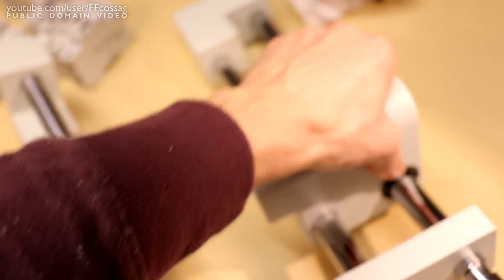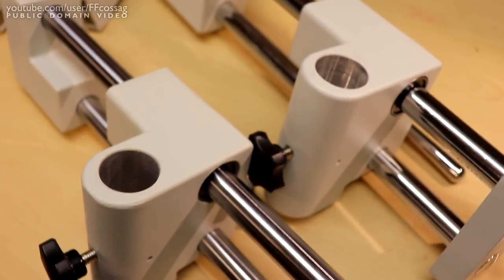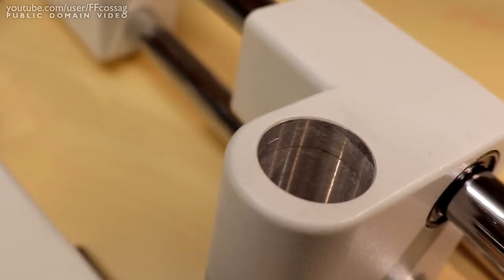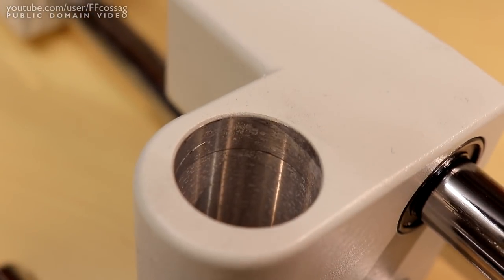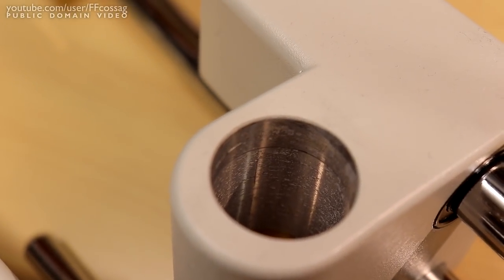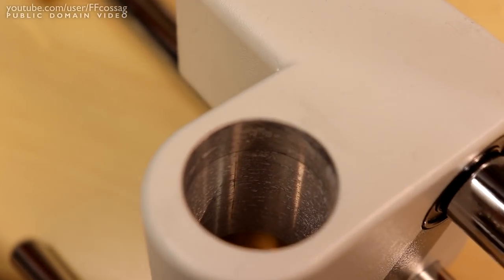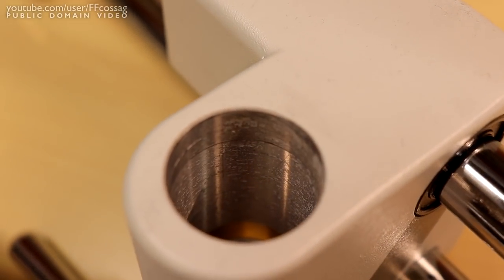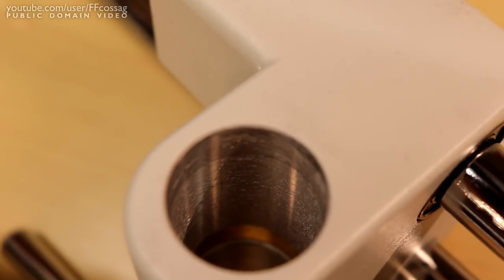I should also point out I'm not sure what the age difference between these two is, but we're definitely using different grades of material on the sliding parts here. You can see that's quite clean in there, a bit corroded, a bit paint splashy, but generally looking fine.